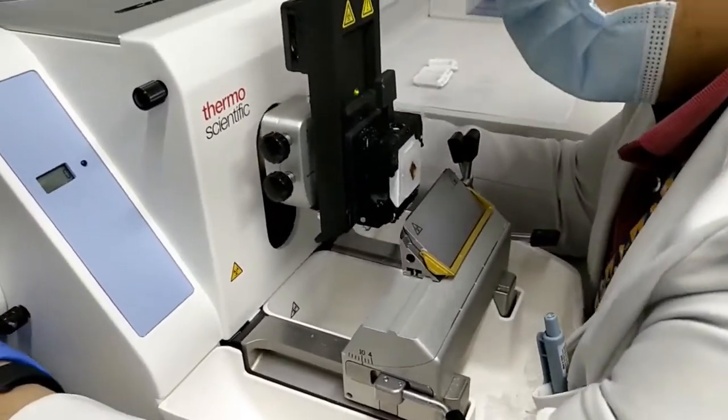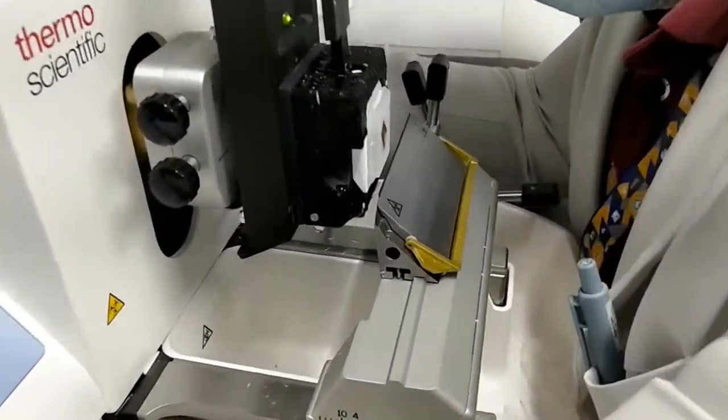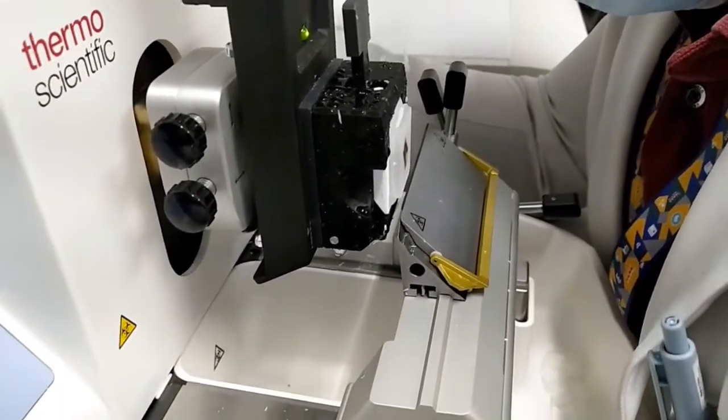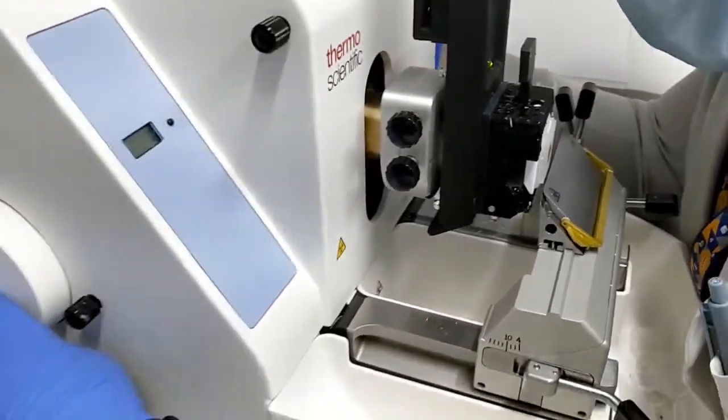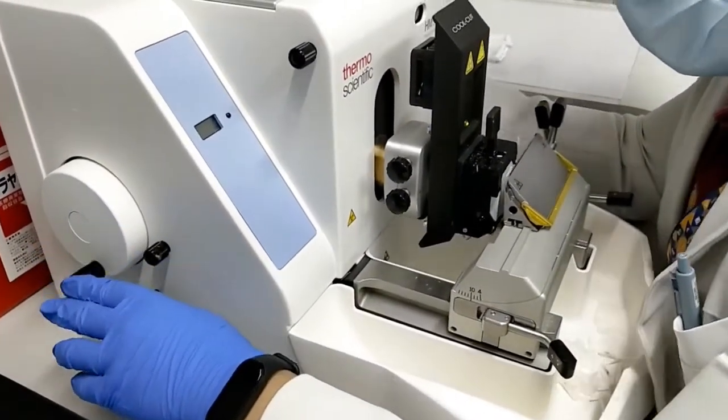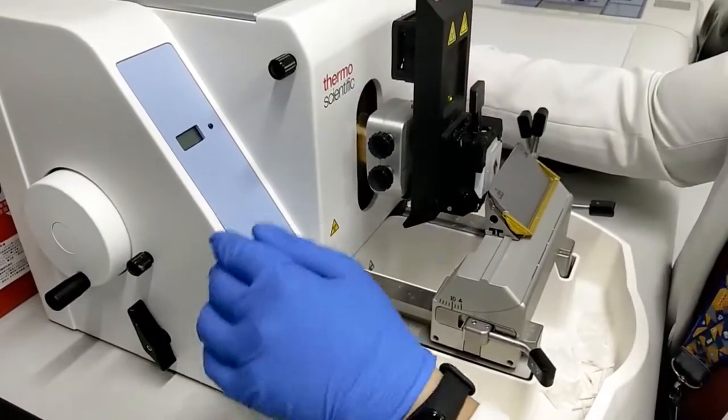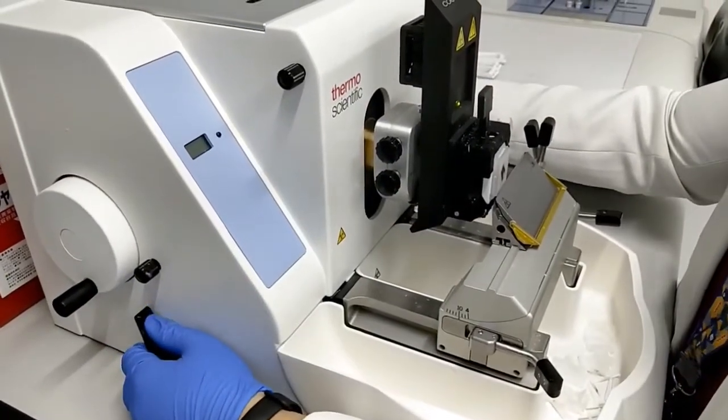Let's go to the block. You have to adjust so that the block fits. The first step in microtomy is trimming out excess tissue.